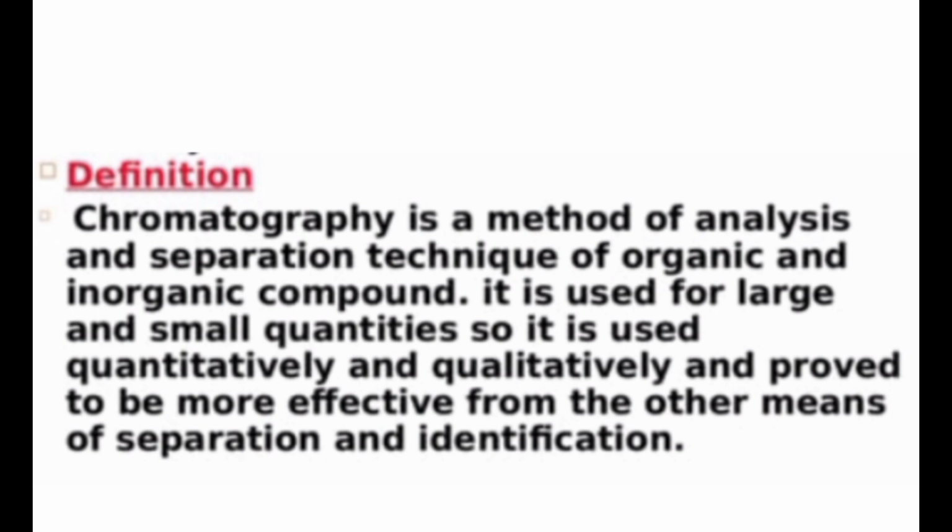Chromatography helps to separate a mixture of components into single components, and it is used to identify the components. This chromatography is used in qualitative and quantitative analysis also. It is used in various analytical methods.